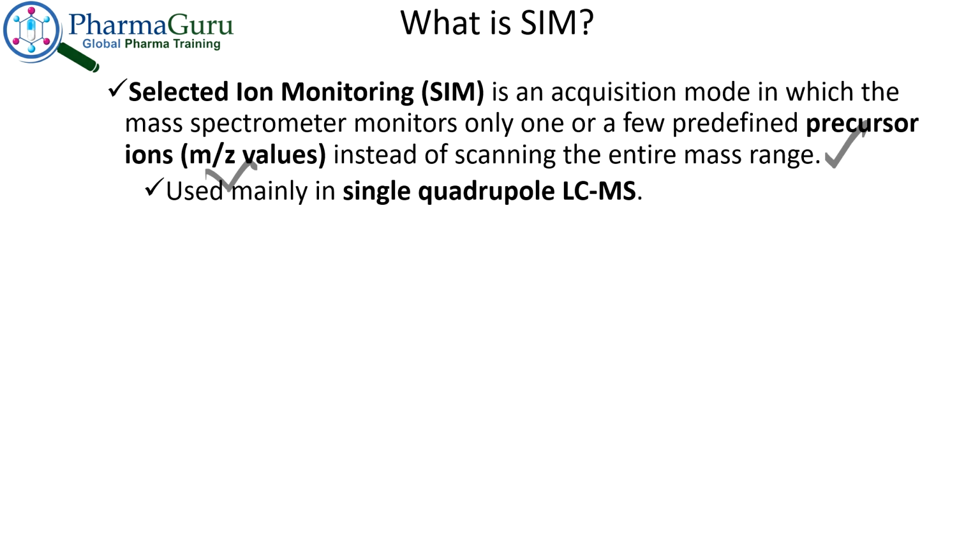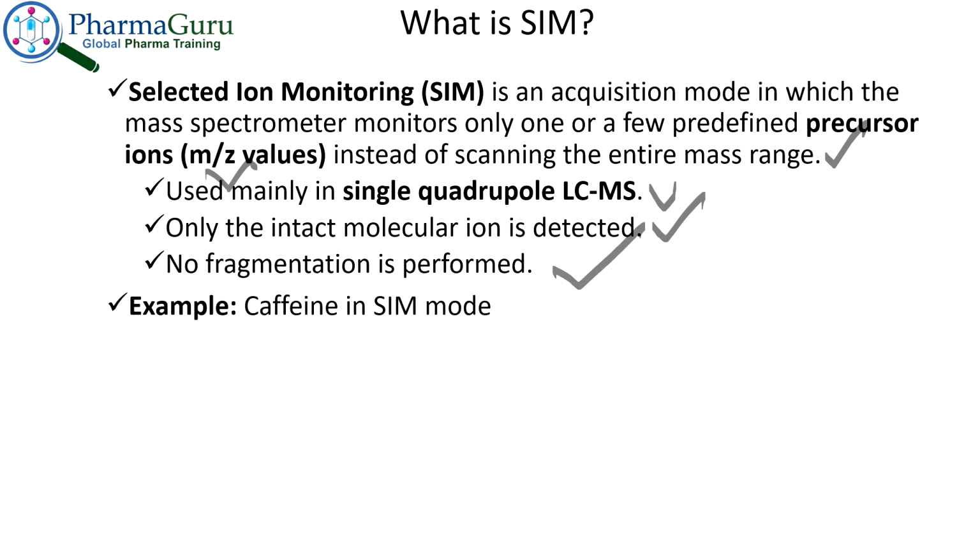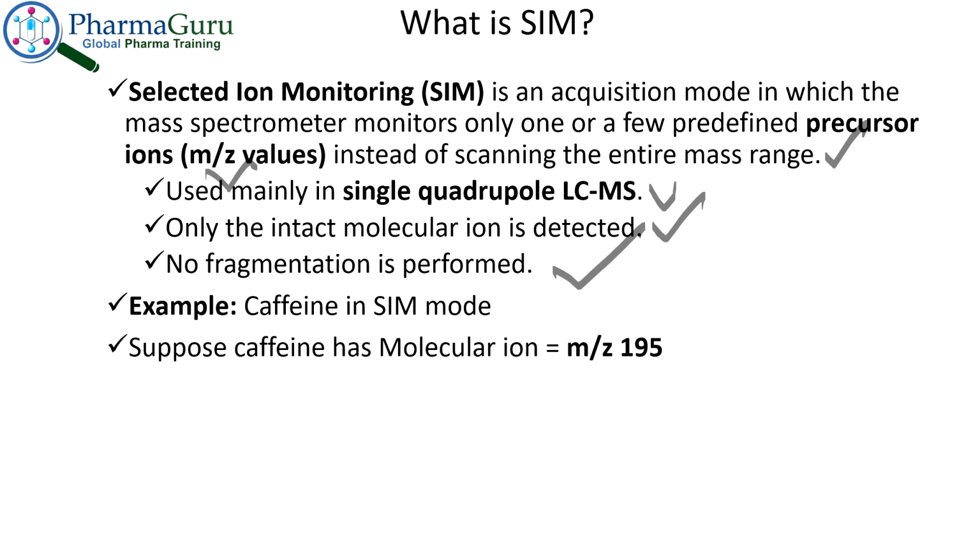Used mainly in single quadrupole LC-MS, only the intact molecular ion is detected. No fragmentation is performed.